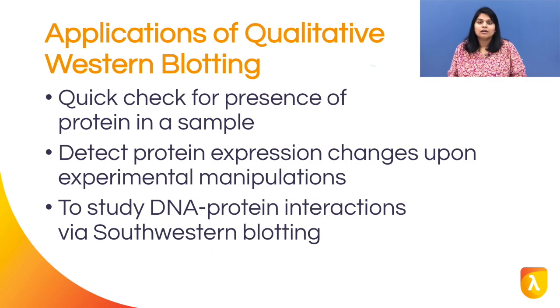To review, the qualitative Western blot may have a place in your studies for a quick check for the presence or absence of the target protein, as when screening a patient sample for Lyme disease. In this case, you would evaluate the Western blot to have the right number of bands at the right place using a simple plus or minus test. The blot is simple and straightforward, since there is no quantification required of those bands.